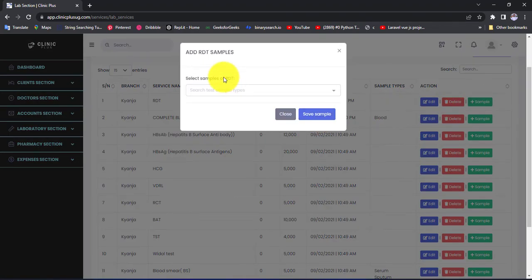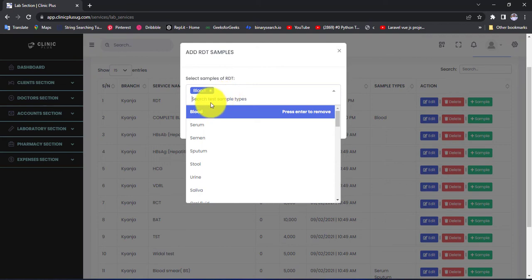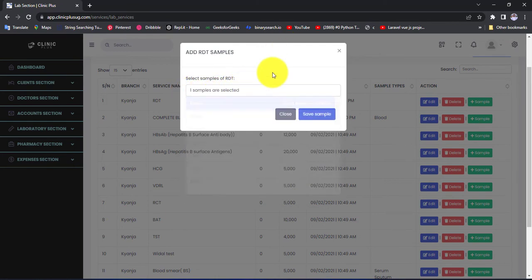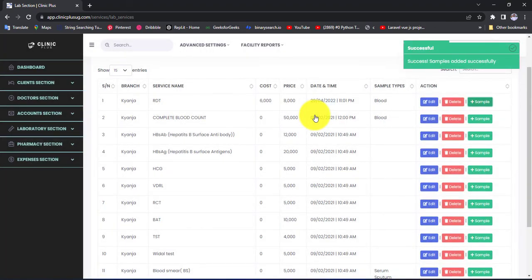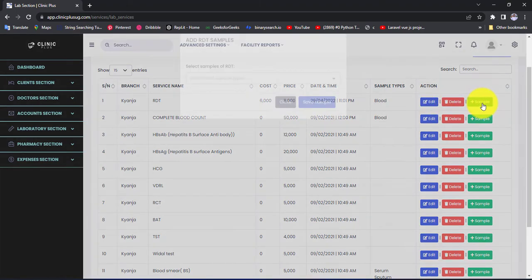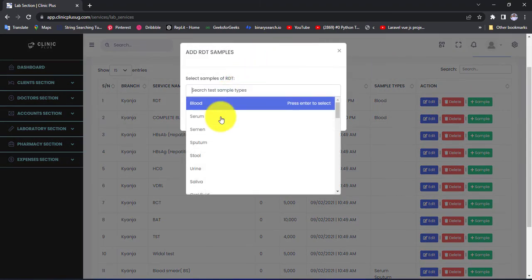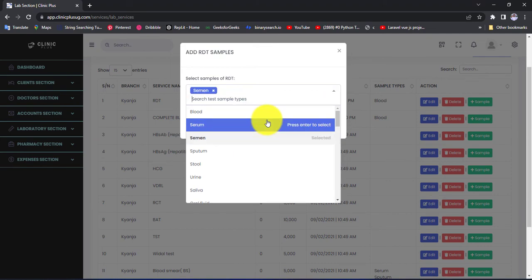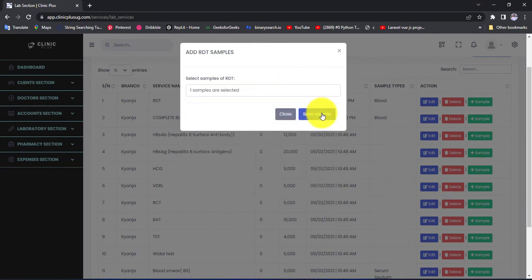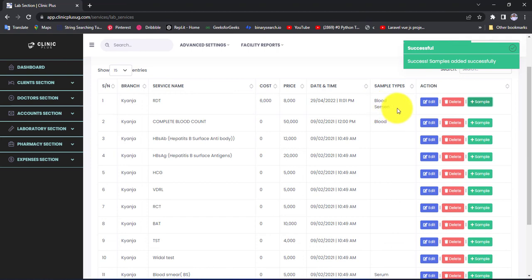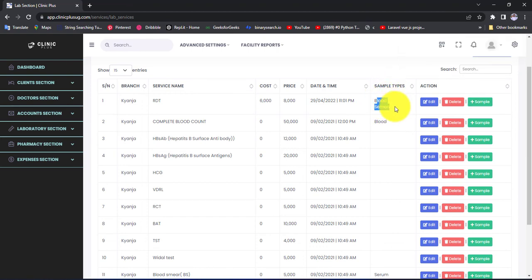To add a sample to RDT or any service in this interface, click the Add Sample button. When the modal appears, search for a sample. For the malaria test RDT we are going to select Blood. After selecting the sample, hit Save Sample, and that sample will be matched to that test. You can add as many samples as you want — let us add another one, click Save Sample, and it will also be added.